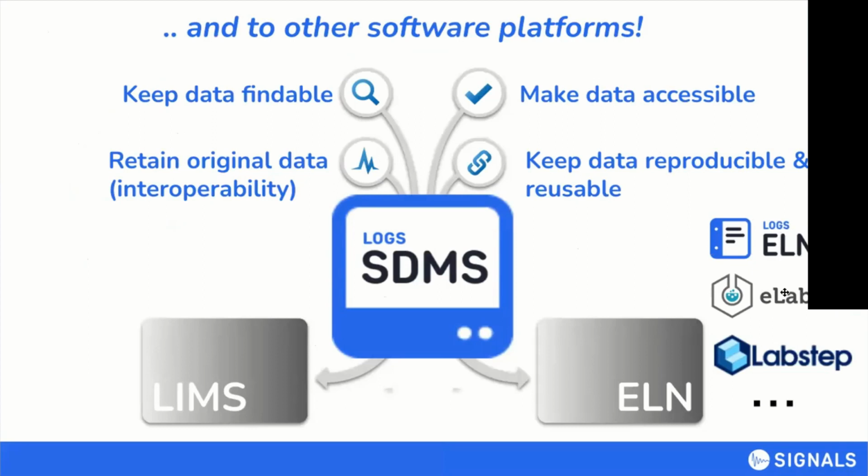But I mean, eLabFTW is, of course, well known to the NFDI people. There are other ELNs that we are already able to transmit information to. One of them is LabStep. For eLabFTW, I had a meeting with Nicolas Carpi very recently, and we both talked to each other, and maybe we'll start a little collaboration. We have to see, it's still in the beginning stages.